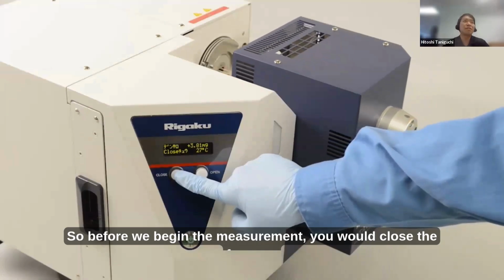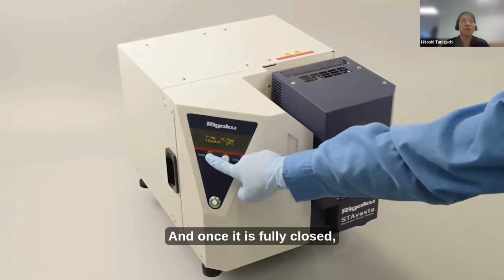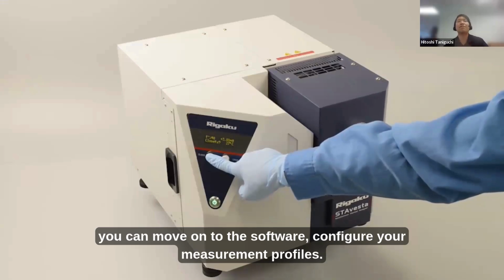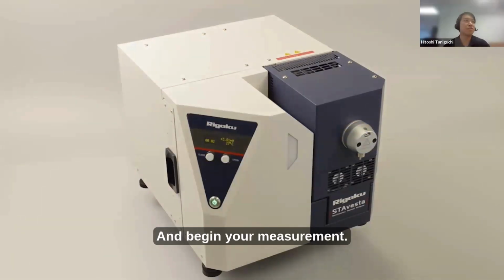Before we begin the measurement, you would close the furnace, as you can see here. Once it is fully closed, you can move on to the software, configure your measurement profiles, and begin your measurement.